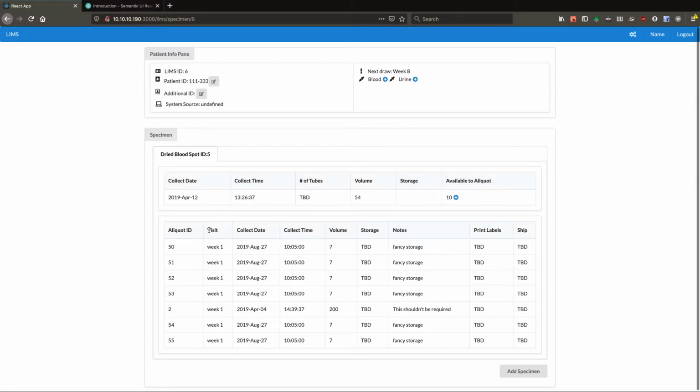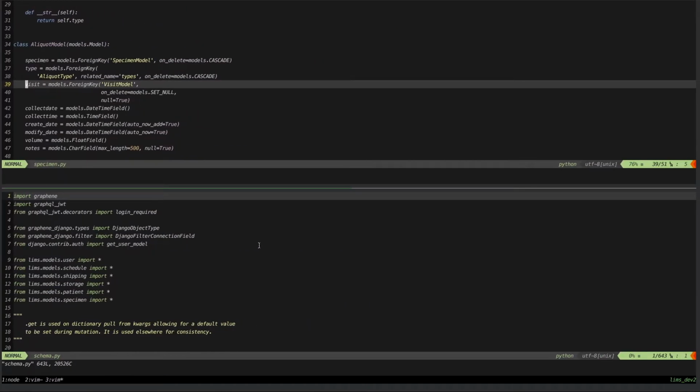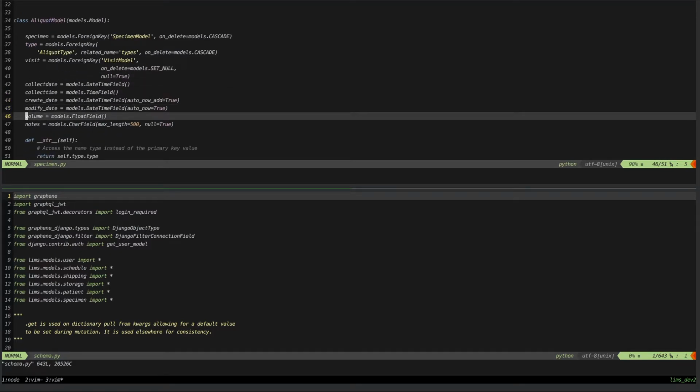As far as the visual concern, you're going to want to know what visit the data coming out is supposed to be associated with. And you're not storing a whole specimen, you're going to usually be storing the aliquot. If you're going back to reference, okay, where's the aliquot from week 3? That's why you're going to want that association there. Just FYI, and I believe that's logical. Some people might correct me later, at which point I'll correct the code.